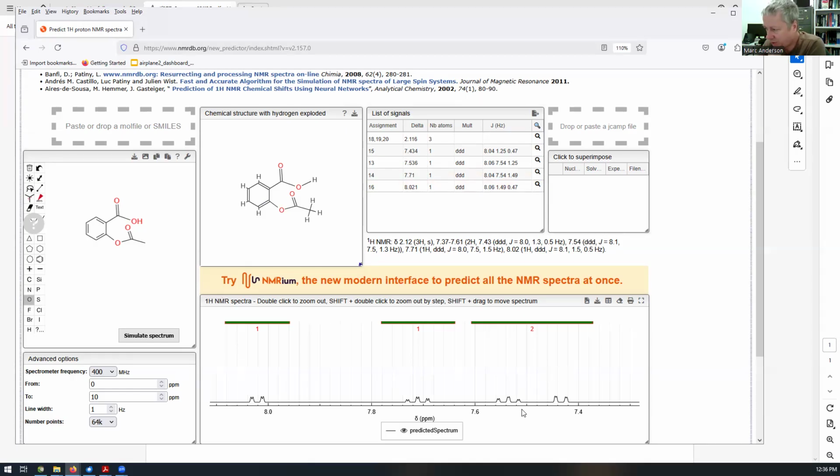But what I will show you is, if I move my mouse over the left peak, that's the doublet. Well, I see that comes up to this top proton. Oh, that's one of those letters. You can do the work. And then the triplet is there. Look on your assignment, and you'll see which letter that is. So that's showing the CH is assigned.